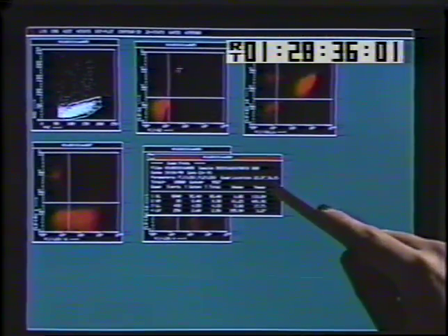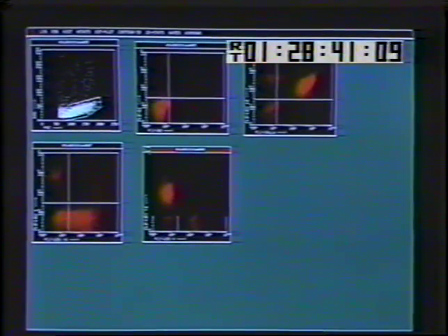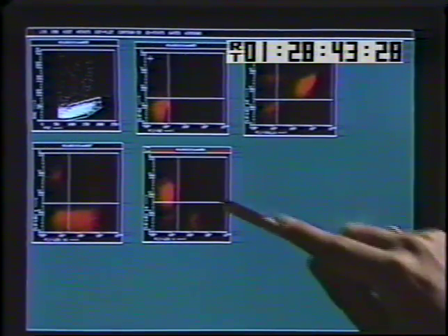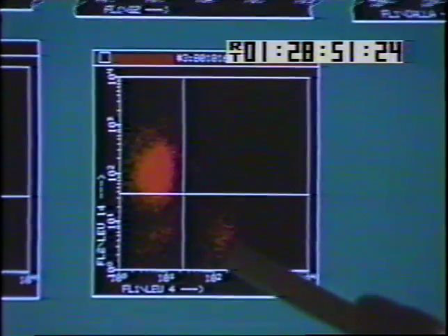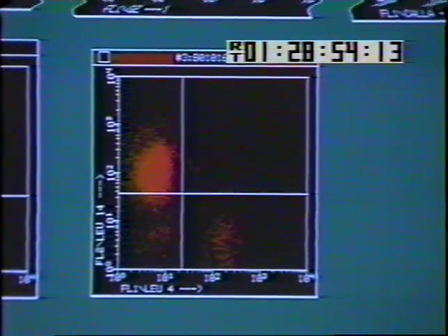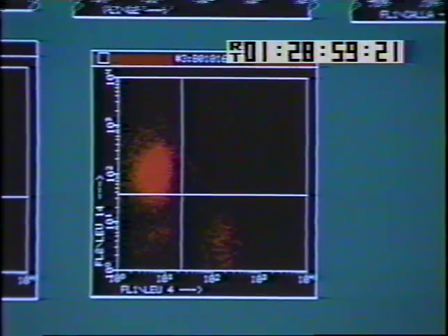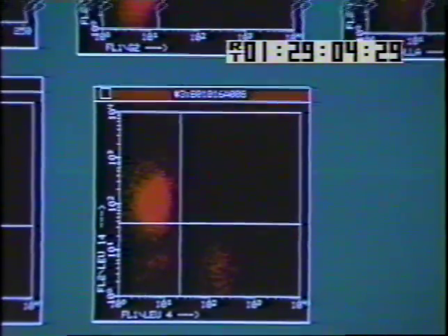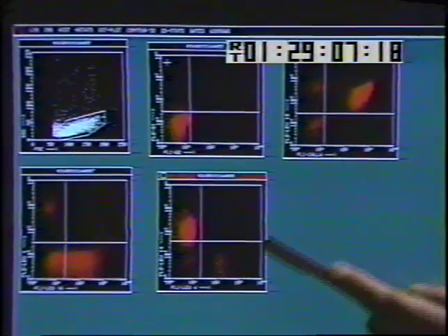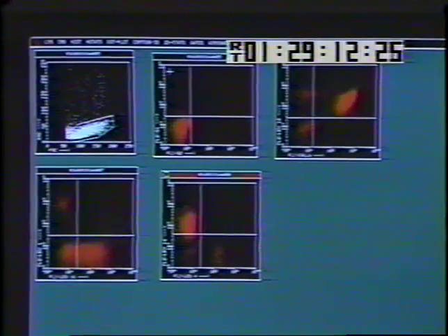The machine is giving us a readout in terms of the details and the statistics associated with each of the quadrants. Here we're blowing up one of the populations of interest. We can identify the leukemic population and the residual normal cells in this individual. So what we've been able to do with this exercise is show how the flow cytometer, making 5 measurements at once, can allow us to identify the leukemic population accurately and also to see the residual normal cells so we can assess and understand the extent of disease.